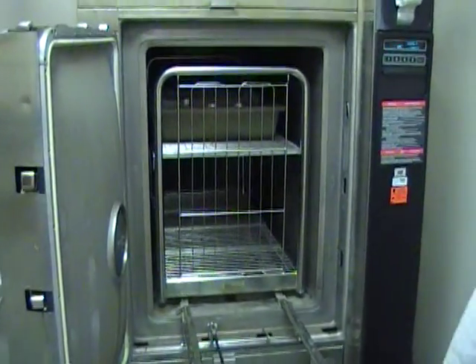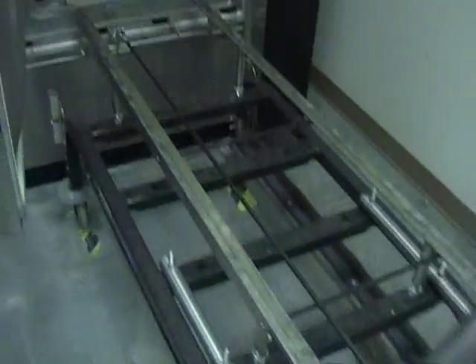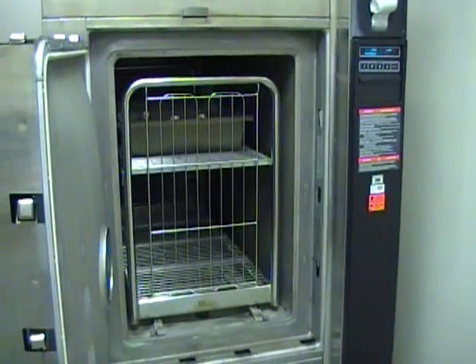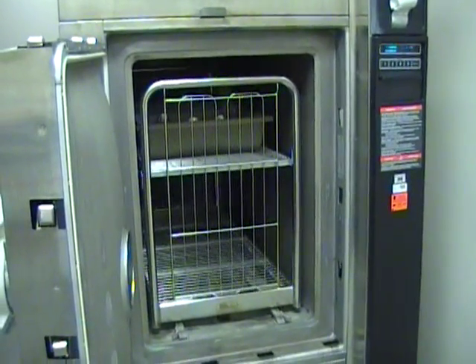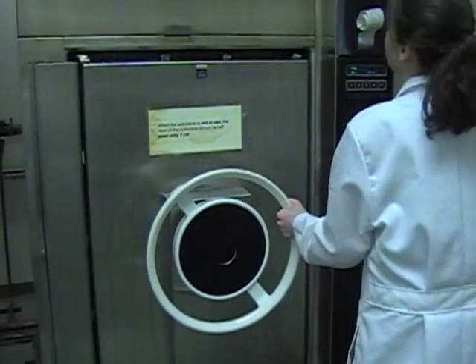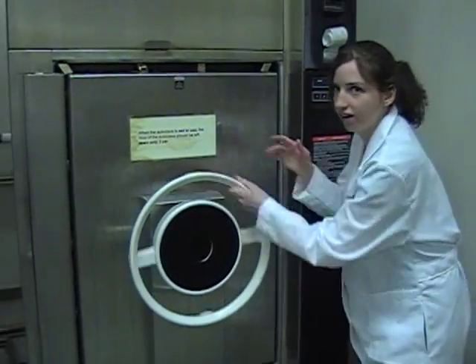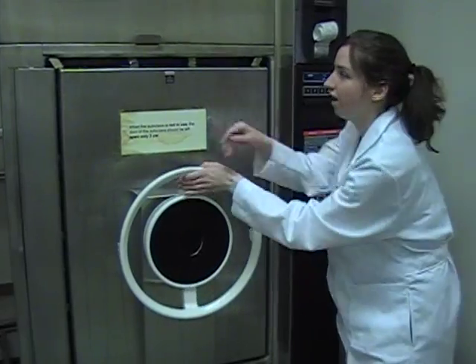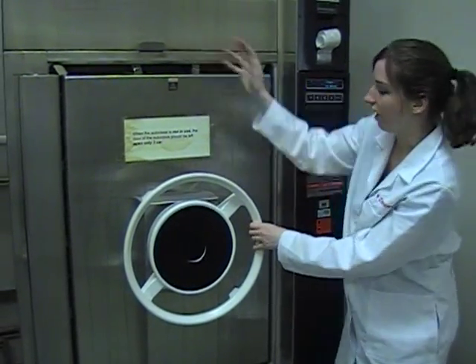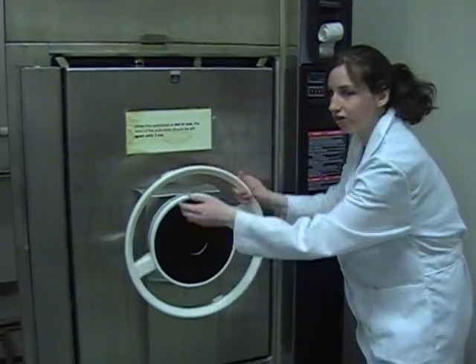Once the cart is in the autoclave, I can pull back on the inner latch and release the cart. Now we securely fasten the door. You want to pull back on this until you can't anymore. This is to create a nice tight seal. If the door is too loose, the steam from inside will create a bunch of water on the floor and it damages the floor, so you want to make sure it's nice and tight.